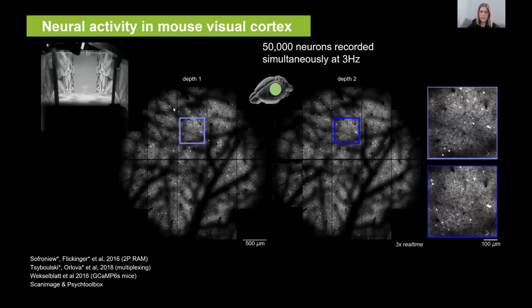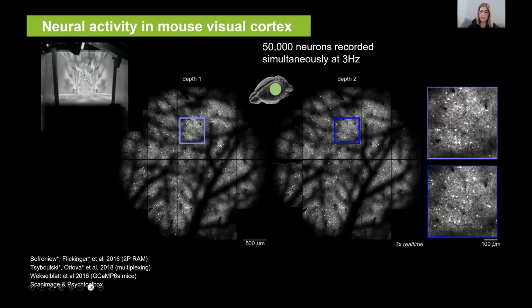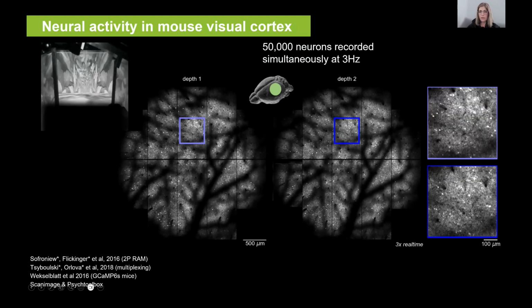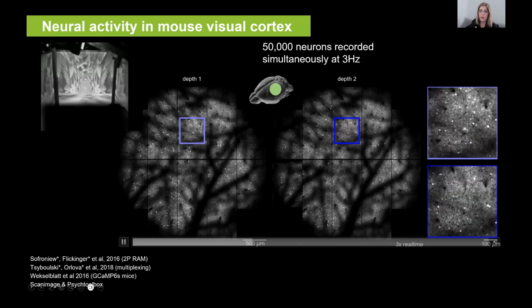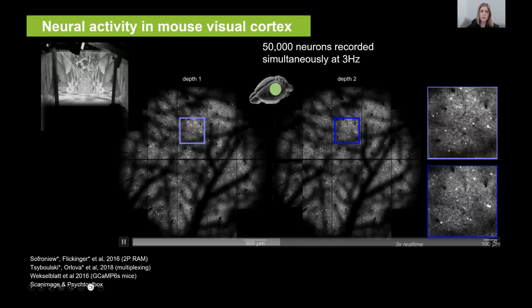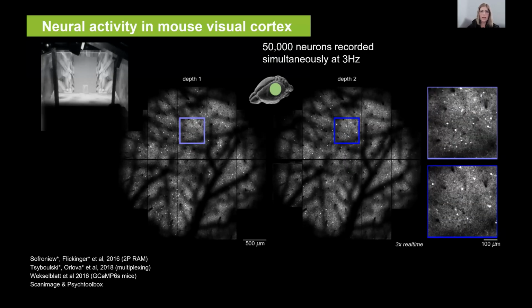So how to deal with all this data. I'm going to show you first kind of straightforward exploratory analyses, and then I'll show you our tool Rastermap for sorting neurons. So I'll show this straightforward analysis in the context of predictive coding. So this is a type of unsupervised learning. And so in the lab, we've been studying a lot of unsupervised learning recently.